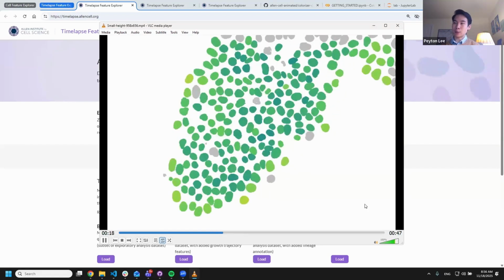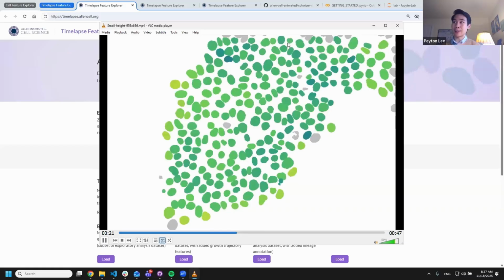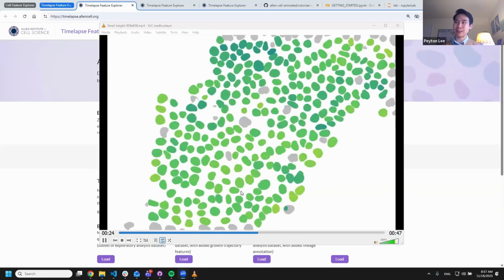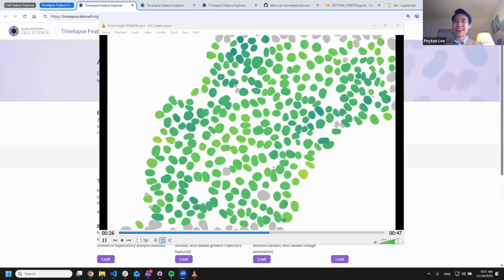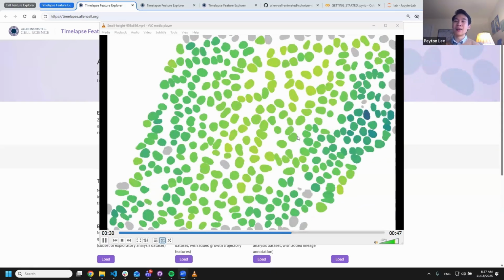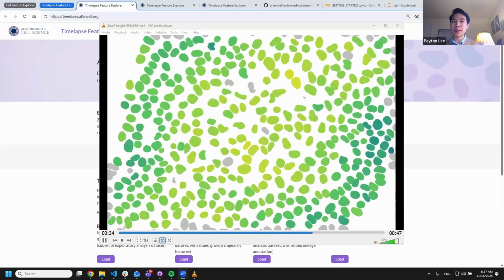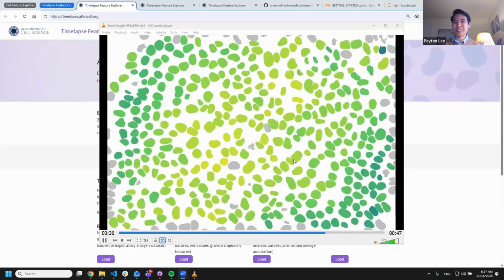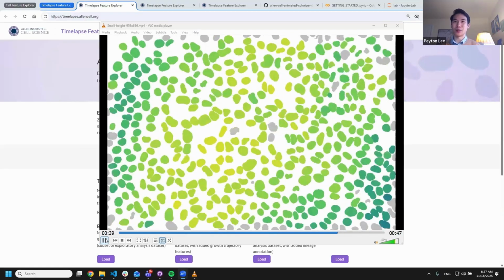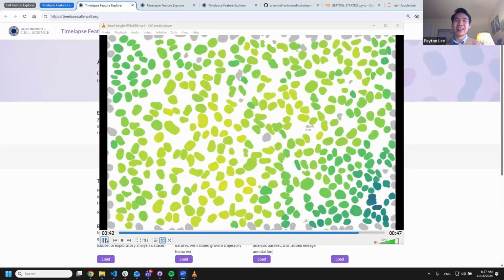But every time a scientist wanted to change this, these videos were taking 3 to 5 hours to generate. If you found a mistake or you wanted to adjust a segmentation, then you had to redo the whole thing from scratch. That was a huge bottleneck for our workflow. We were like, these videos are awesome, but we also have to start running them overnight.